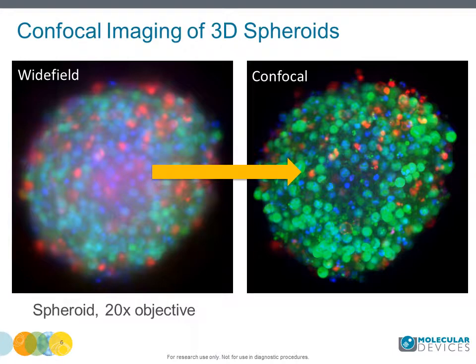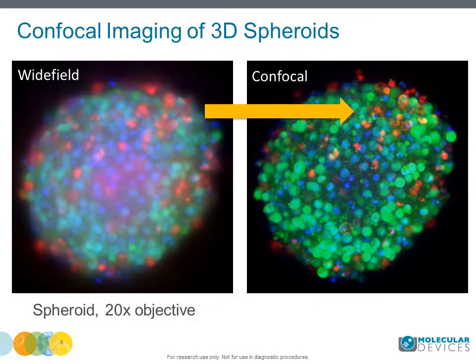Another challenge in performing a spheroid assay is the ability to image and analyze 3D objects. Common issues include difficulty of light penetration into spheroids, scattering of light by cells, and background from out-of-plane fluorescence, which makes images blurry. Confocal microscopy provides efficient background rejection and gives sharper images.